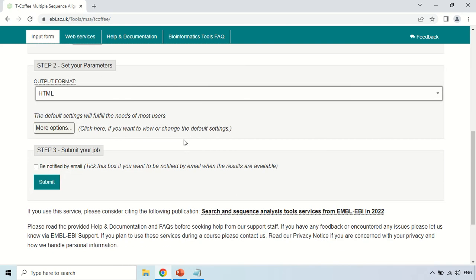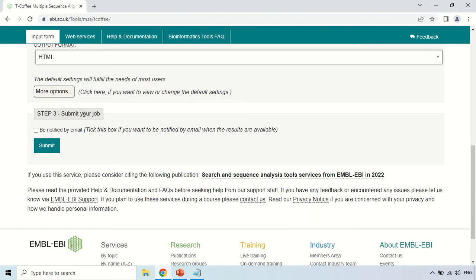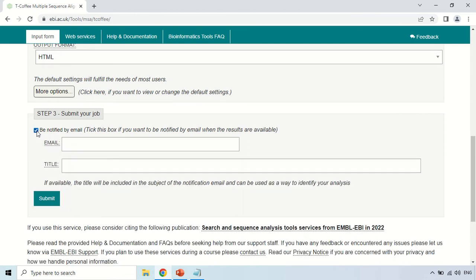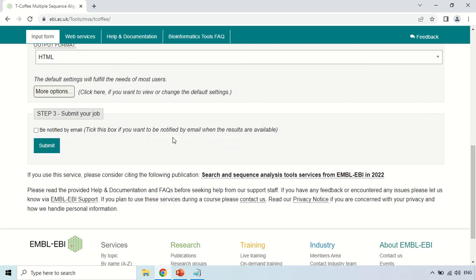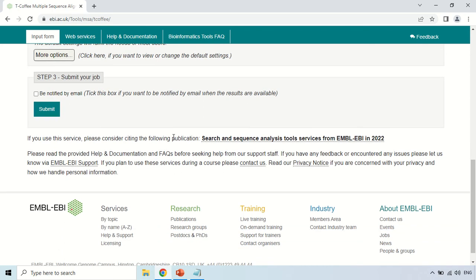There are certain other options, but the default options are sufficient for most users. In the third step, you can be notified by email — if you check this box, you can enter your email and the link to the results will be emailed to you. In the title section, you may give a title to this job. For this instance, I am skipping this and unchecking the email option. After this, just click the Submit button.